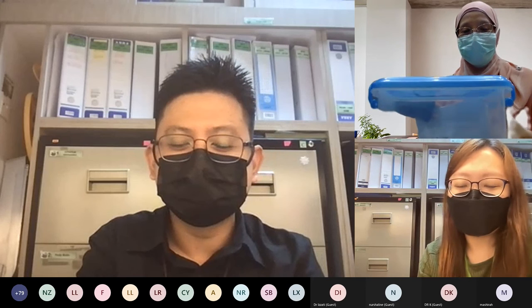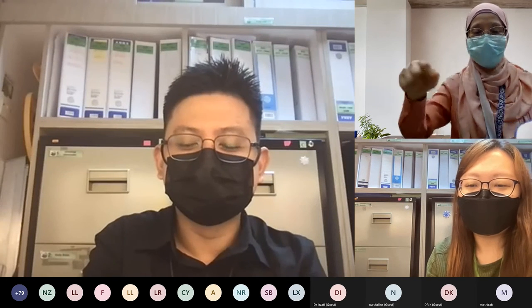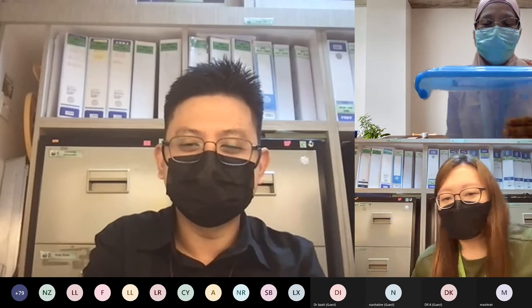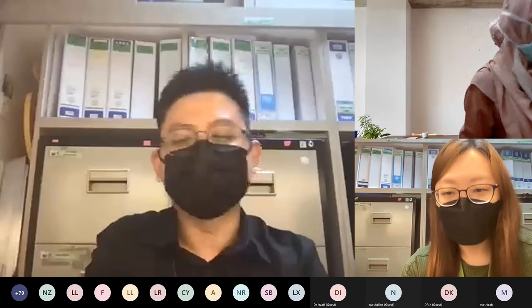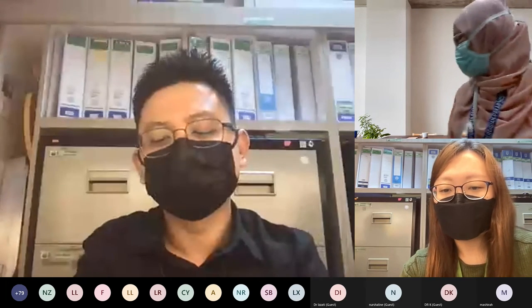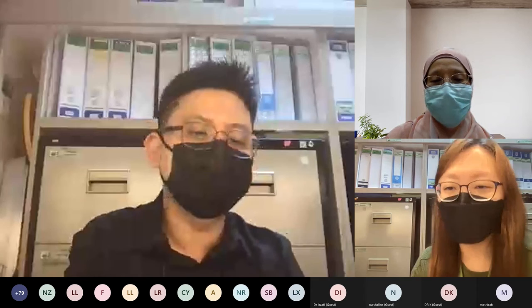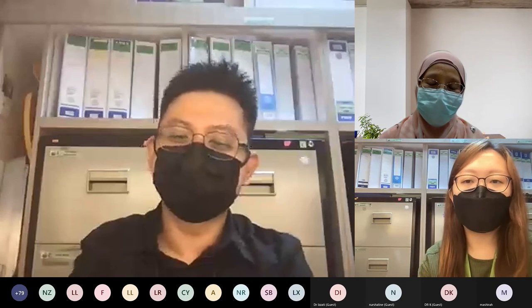Plastik macam ni. Okay, you can't be walking around bringing the specimen just like this in your hand in a plastic. You get something like this, store it in a storage box like this, and you carry it to the lab. All right. So Dr. Shalin, that's considered 3 layers so lah kan? Yeah. Consider lah, but not quite with the material and everything like that.